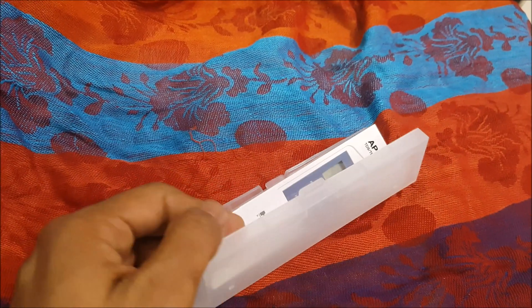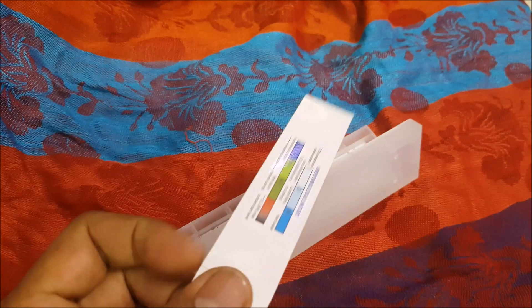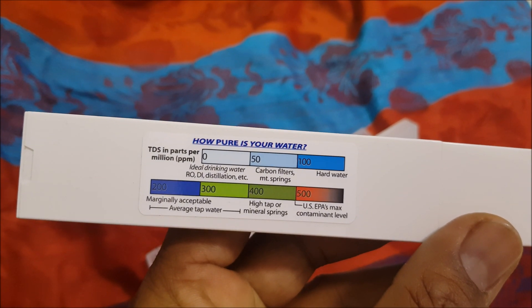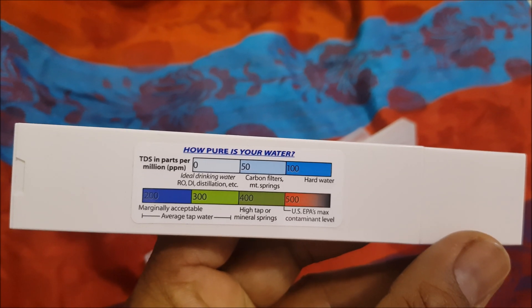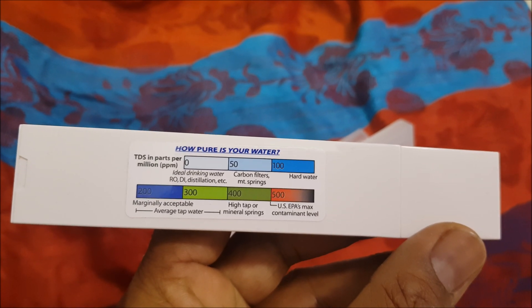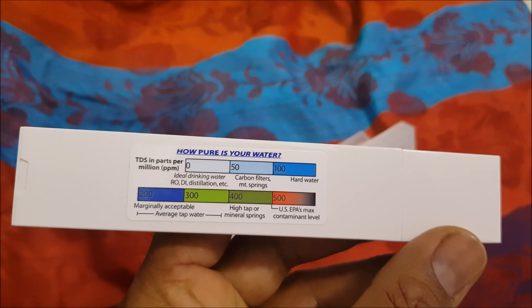The case is good and the quality of the product is really good. It also comes with a chart showing the TDS level ratings for different types of water, including what could be marginally accepted and the contamination levels.